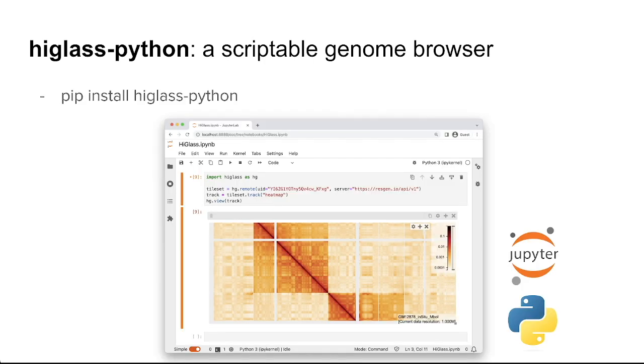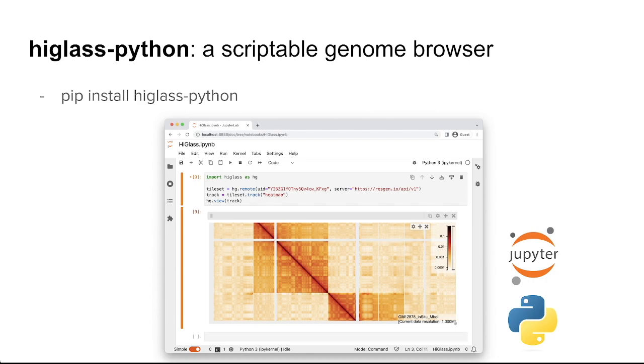At its core, HiGlass Python exposes a simplified Python API to get started with HiGlass. You no longer need to start with a Docker container or move your data around to be able to use HiGlass. Just open a Jupyter notebook and load your data.